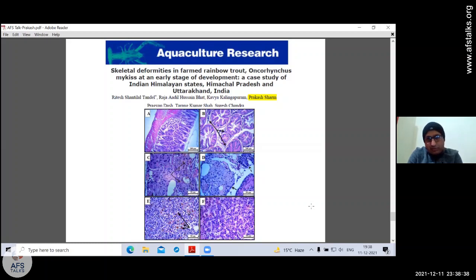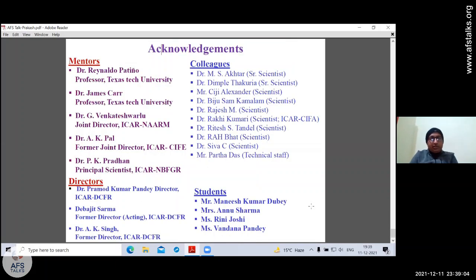Here in this work, what we could see was that selectively or specifically only the pancreatic tissue was degenerating. The necrosis of the pancreas, necrotic degeneration of the pancreas was seen in this study. So this was one of the first histopathology works we did in our institute.